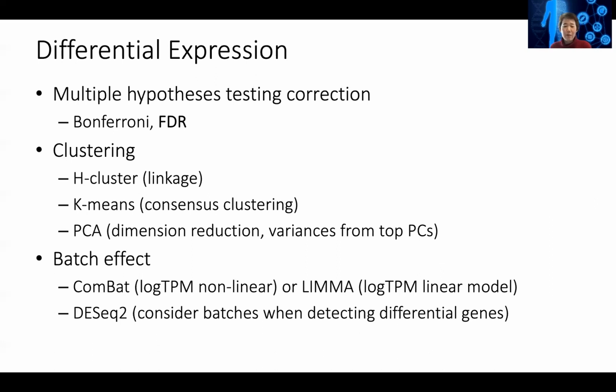Usually, I would say for that, you would probably use Limma. CPM is okay, TPM is okay, these two are okay. But for DESeq, you can also run DESeq with simple batches, but that will only give you the differential genes, and it will just consider this particular batch as a variable that it needs to normalize out.